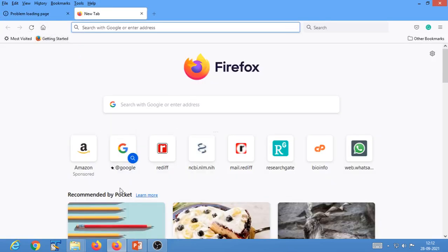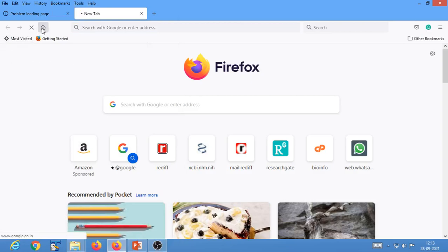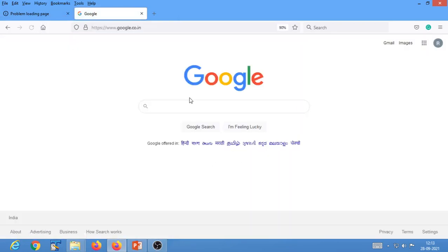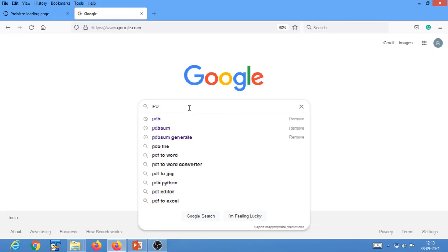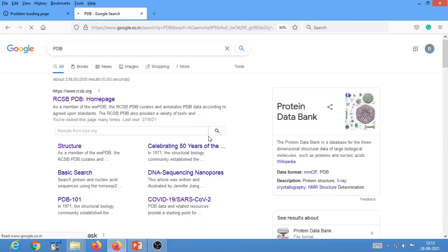Oh, have I bookmarked it? Here we go. So follow the RCSB web page over here.